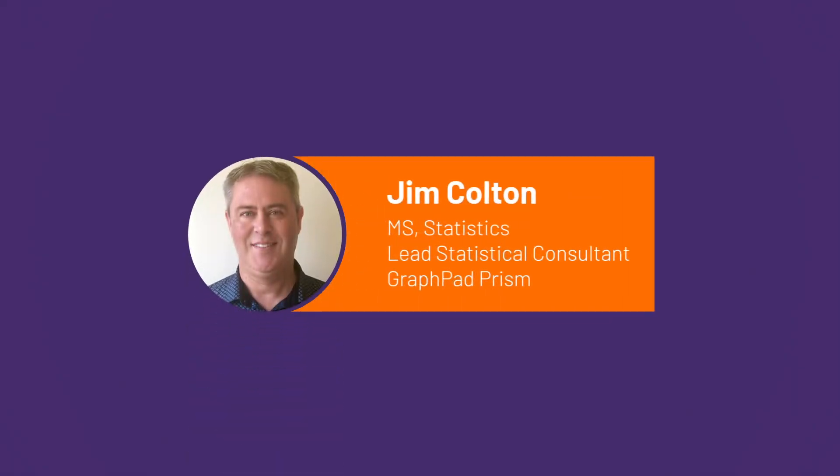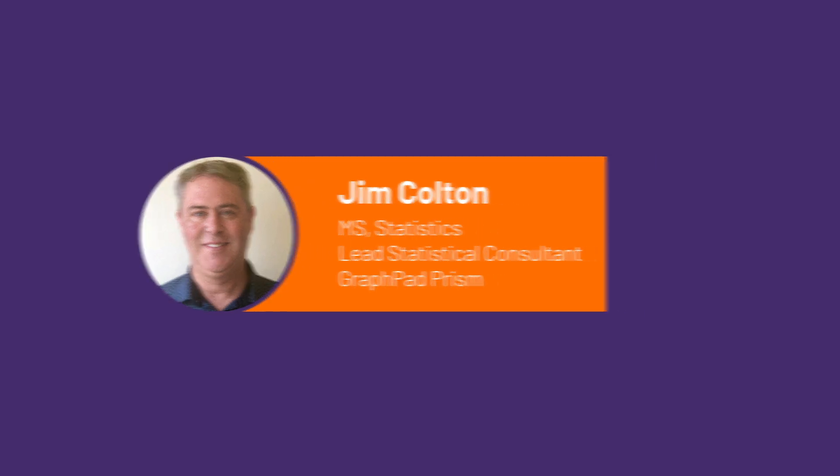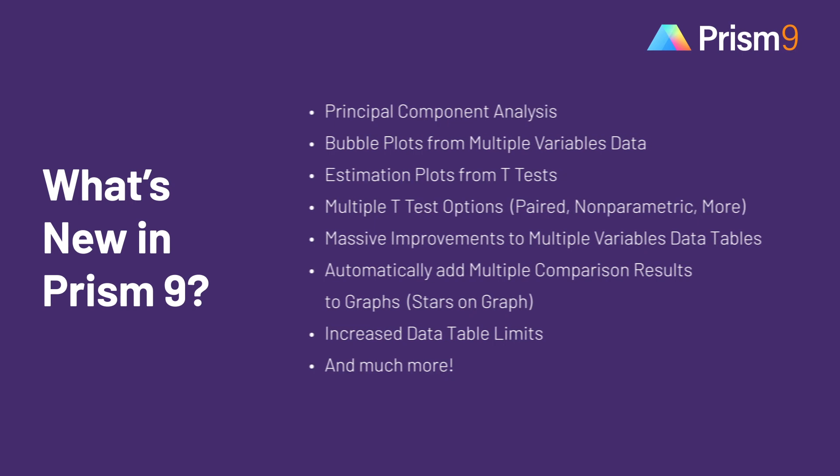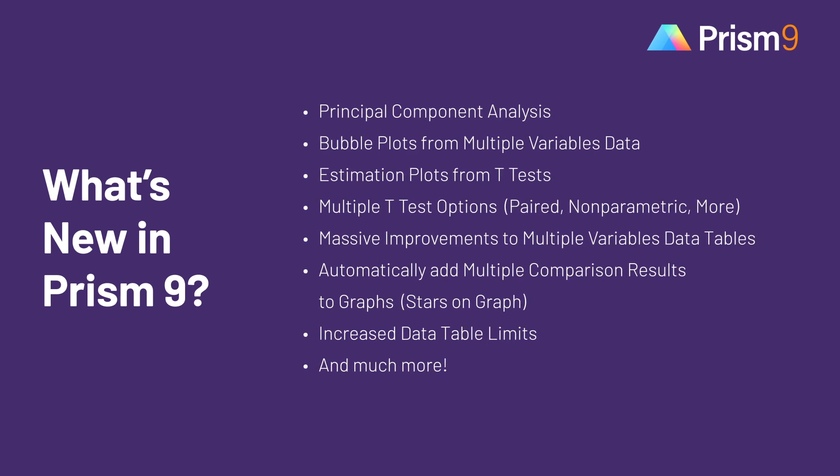This is Jim Colton from GraphPad. In this video, I will highlight the major new features of Prism 9. Prism 9 introduces a number of great improvements, including all new analyses and graphs.